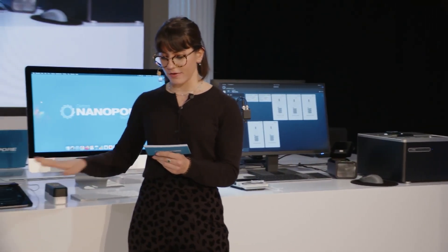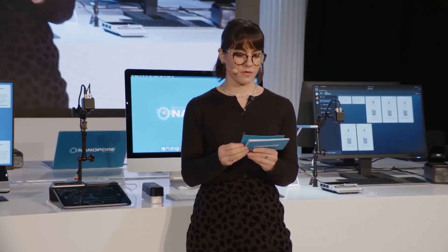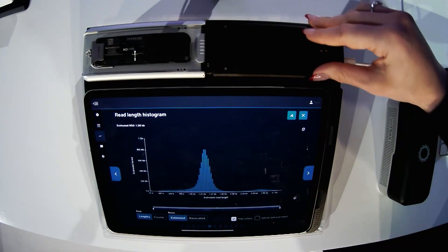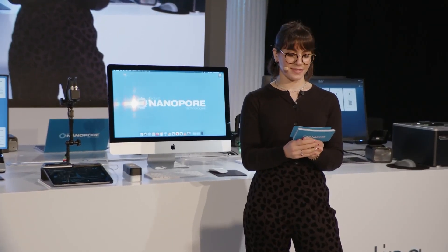I'm happy to present the newest device in the Oxford Nanopore lineup. The MinION Mark 1D takes advantage of the extremely powerful Apple iPad Pro, and our custom case incorporates our beloved MinION flow cell as well as charging functionality, bringing portable sequencing to a whole new level. In the future, it will feature a more optimized MinKNOW taking advantage of the Apple M1 chip and further M-series chips. The MinION Mark 1D also brings on-device base calling, ensuring you can analyze data on the go. It will be available for early access during the second half of 2023.